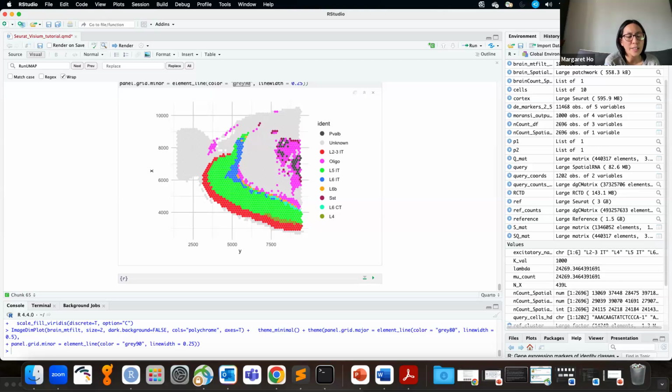Okay, so if single cell data for the specific species is not available, is it possible to use data sets from related species? Yeah, I think Colton might actually have done something like that, because you can use a single cell RNA-seq data set. Actually, I've done it a little bit too. We've done things where it's non-human primate. You can do it.